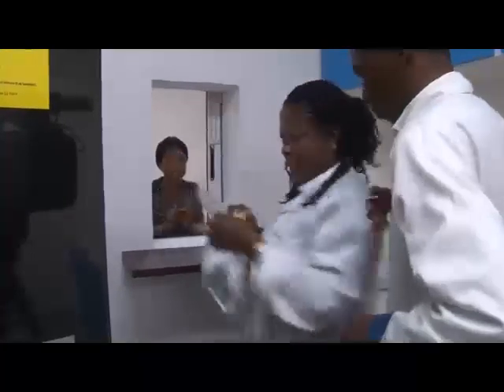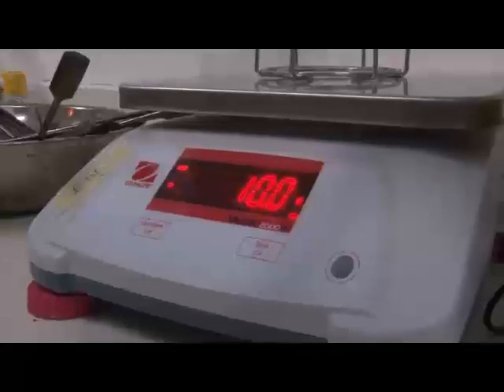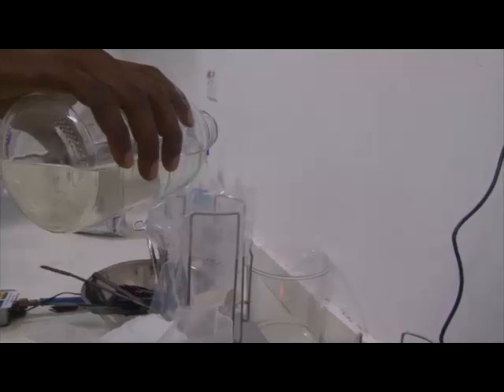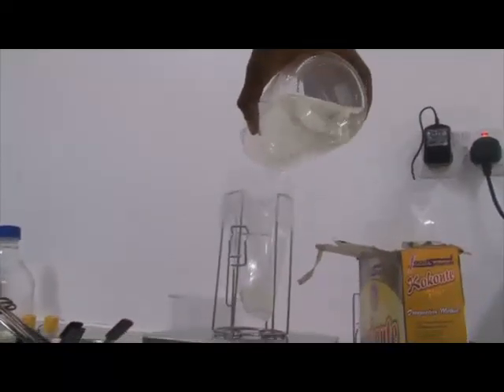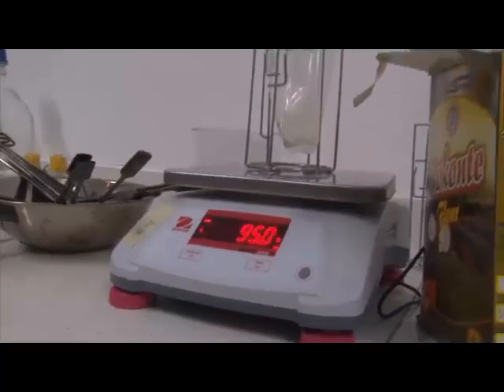A solvent is applied on the sample on a plate to dissolve it. The spout of the bottle containing the solvent is flamed to sterilize that item before contents touch the sample plate. Dr. Margaret Owusu sheds more light on this stage of the process. If you don't work under sterile conditions and sterilize everything, then you are also introducing contaminants, and whatever you come up with, you can't say that it's from the food. It could be from your environment or the things you used.